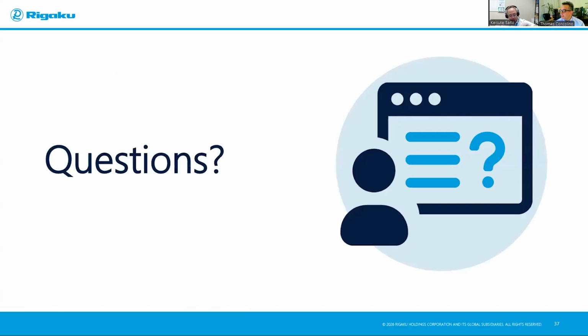Okay, thanks, Keisuke. We've had some questions come in, and I'm going to merge three of these questions together, Keisuke, because they were all a little bit about software. The first question was, can I do SAXS if I have multiple form or structure factors? So it's that multiple kind of setup.